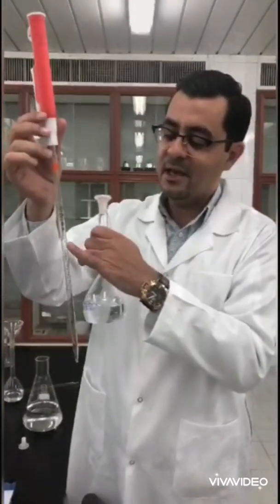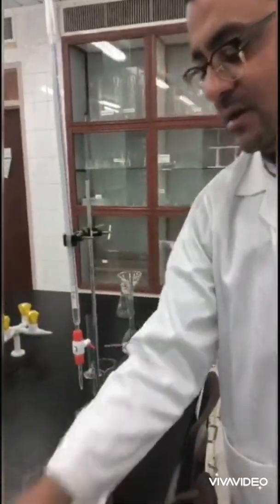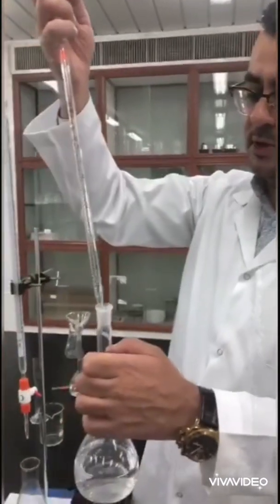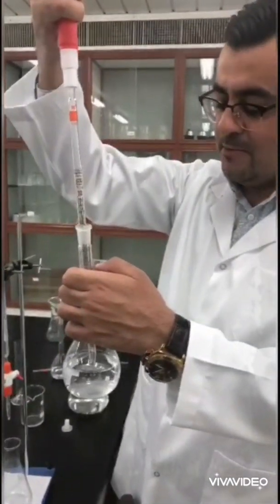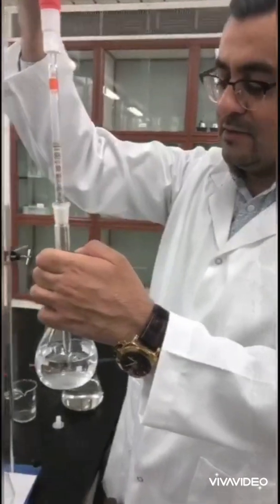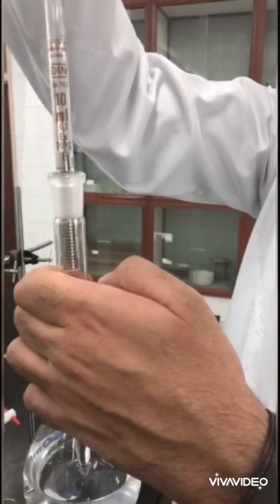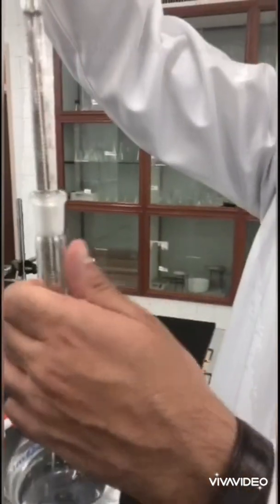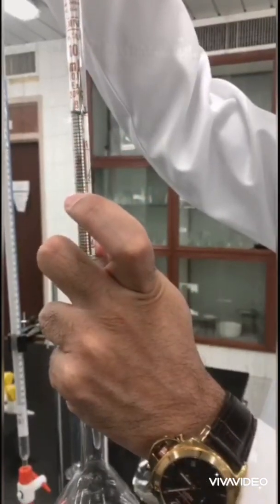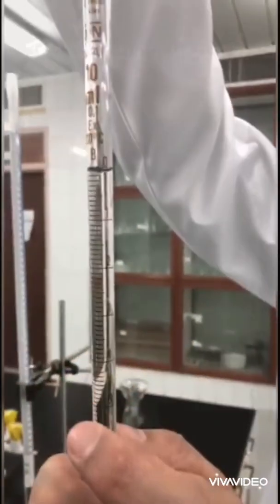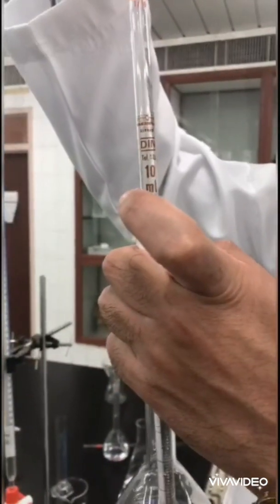I'll take exactly 10 milliliters, then I will start the titration process. Here I am using a 10 milliliters pipette, so I will fill it to zero. You can focus here on the zero division. I don't know if it's clear. Maybe I need one more drop.